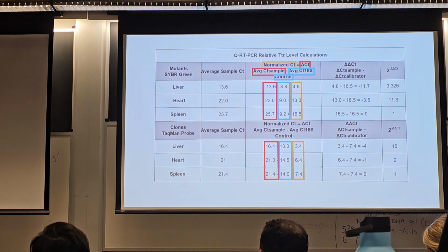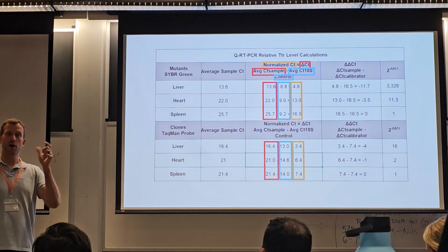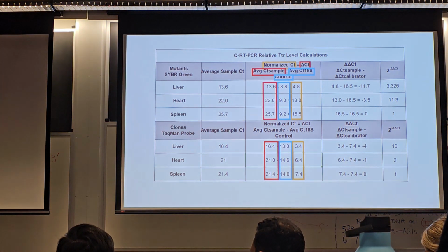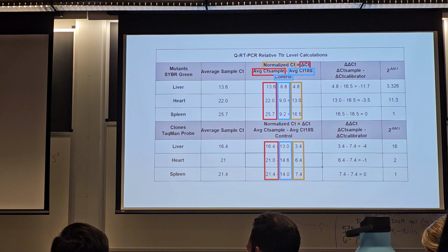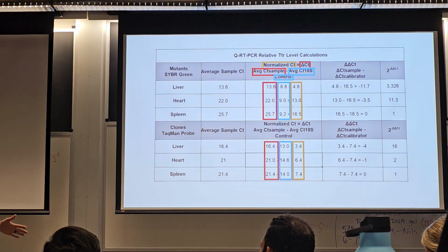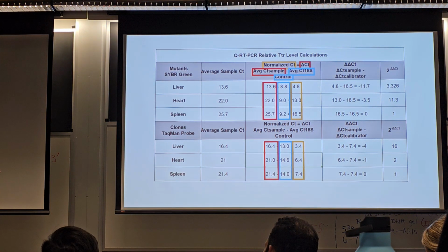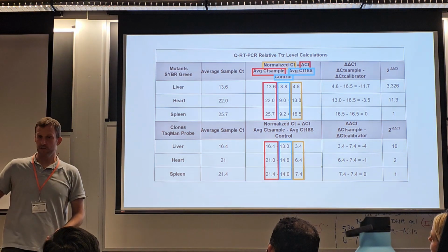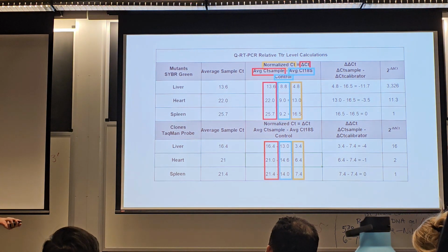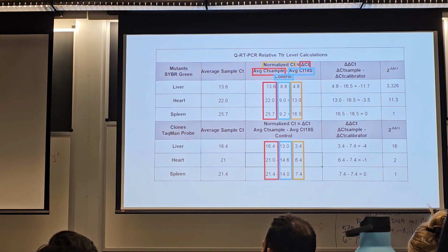We called one thing spleen and it was actually liver or heart, I don't remember, because we had fantastically early amplification for spleen and much later amplification for something else. I didn't correct for that in here, because I wanted to be able to talk about it. And really, after we finish this, if you want, you can calculate the fold change for your individual sample independent of everyone else, and see what you get.